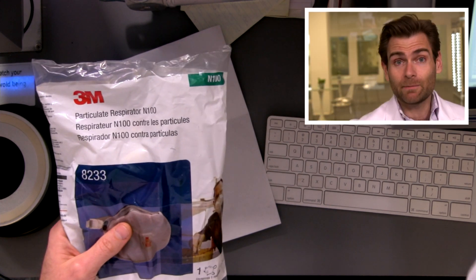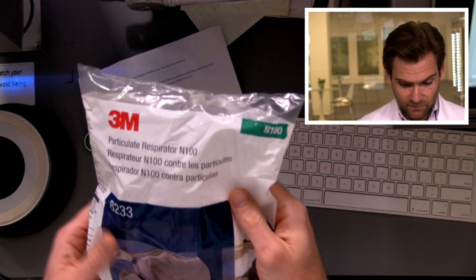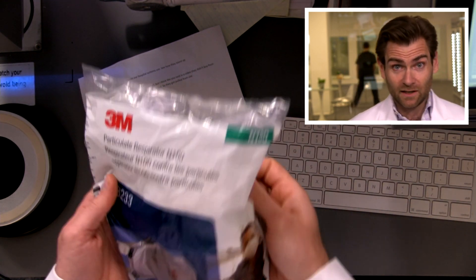Starting out with — I mean, this thing's got to be worth a lot. This is a 3M 8233 N100. The 'N' in N95 stands for non-oil, and the '95' stands for 95%. So this is supposed to pass 100%. The crazy thing about the N100 is it's a much crazier test than what we're going to do here. The seal has got to be absolutely insane. We've gotten a lot of things on this machine at 99.99999, but we've never gotten a hundred. So I'm excited to open this up.